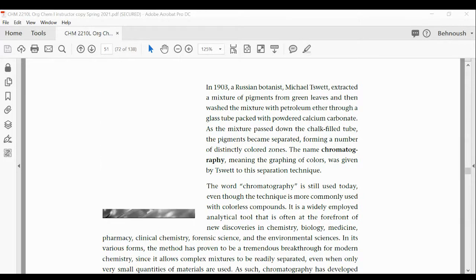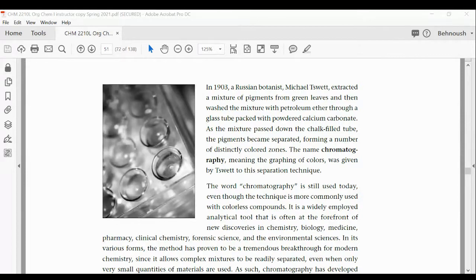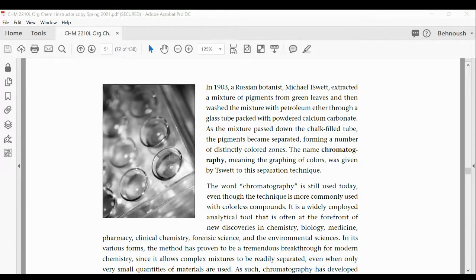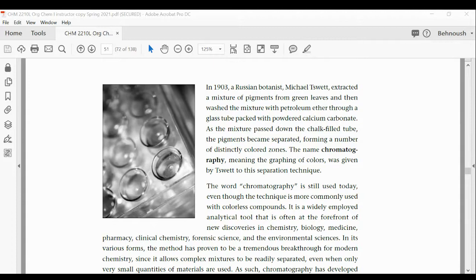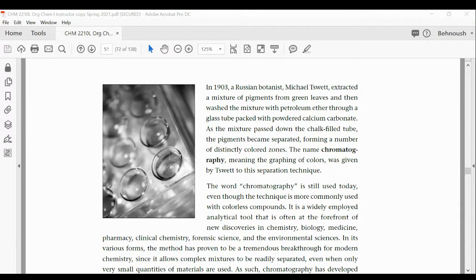The samples are placed on the TLC plate, and you see how much the solvent travels and how much the sample travels. And then what? Okay, matching the RF value based on known samples. So you have to do the TLC. So Sammy, what you're referring to is the part of the experiment. But when you get the data, you have the RF value for your sample. You must have RF values for known samples that are possible or potential identities for your compound.